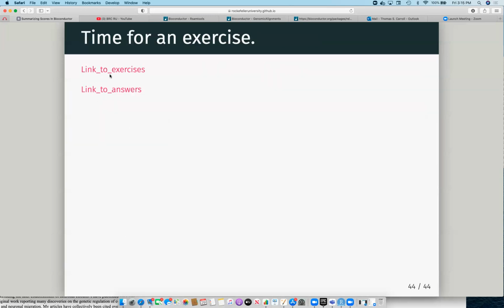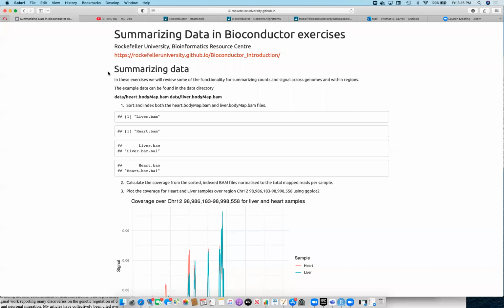So that's actually the end of our session for today. I have some exercises to work through. We have now completed everything we would need to know to do RNA-seq, ChIP-seq, and single cell. From now on, we're really just going to be reusing these techniques, but in context. It's a really good way of learning, I find: take this and then apply it.